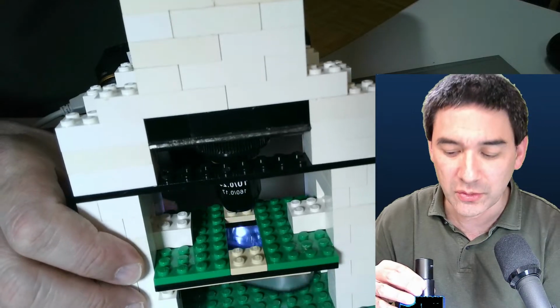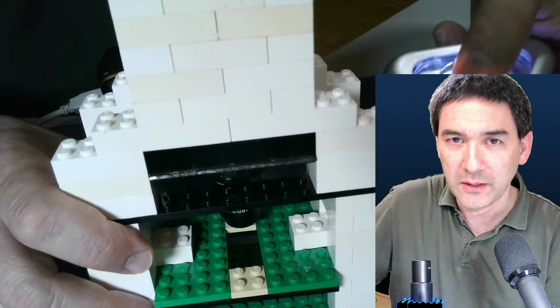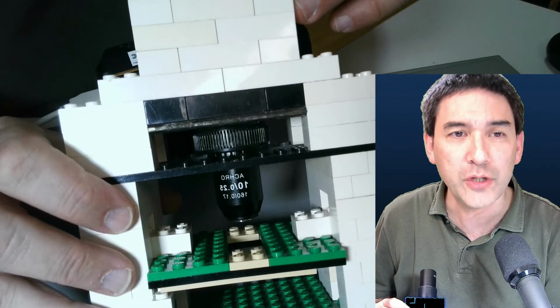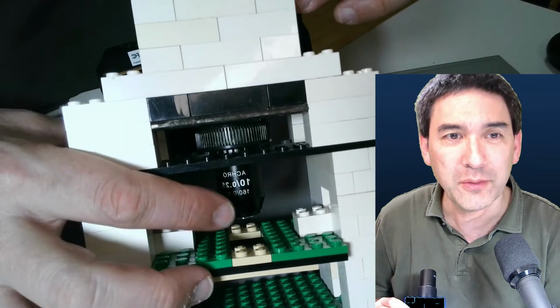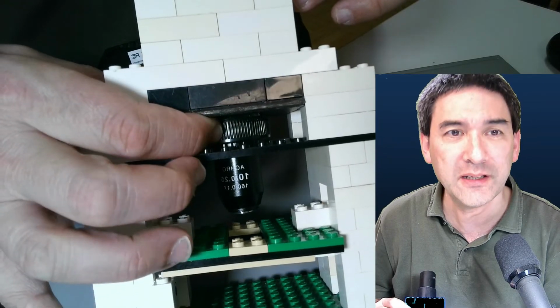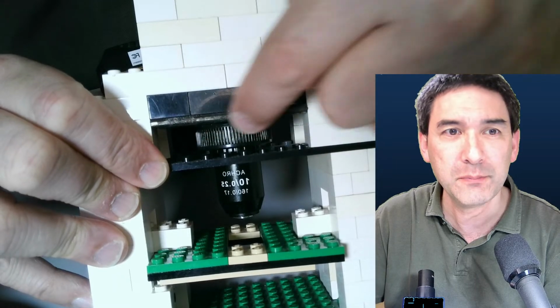The big question now is, what about the objective? I would like to quickly tilt this over. I'm going to turn off the lamp as well. And if you look here, then here is the objective. It's a mirror image. But how did I actually connect the objective here? This here is a piece of plywood, just a piece of wood that I used.